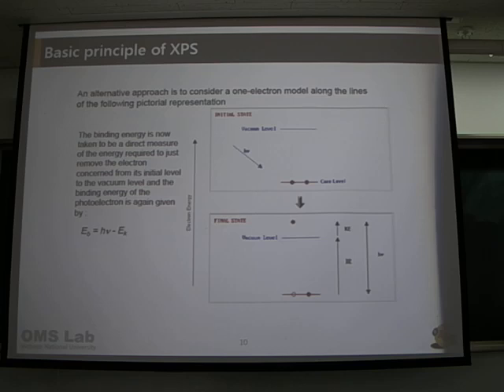Yes, that's what we are measuring: the kinetic energy, not the binding energy. Using this equation, we can then get the binding energy.